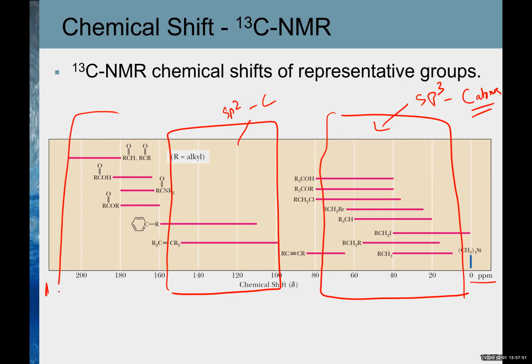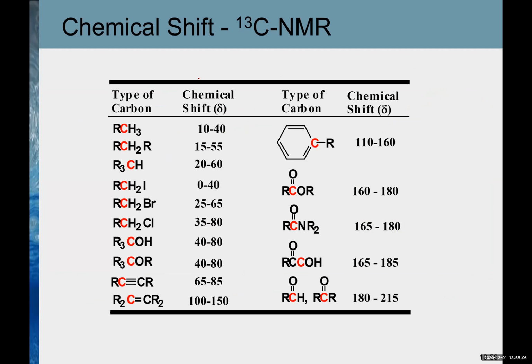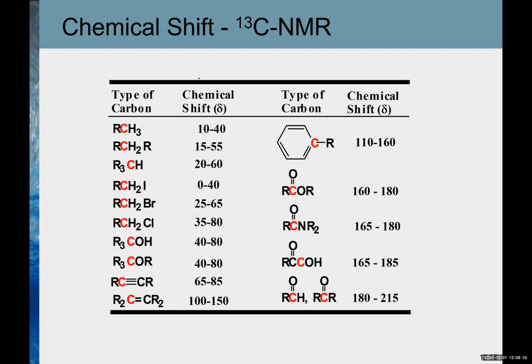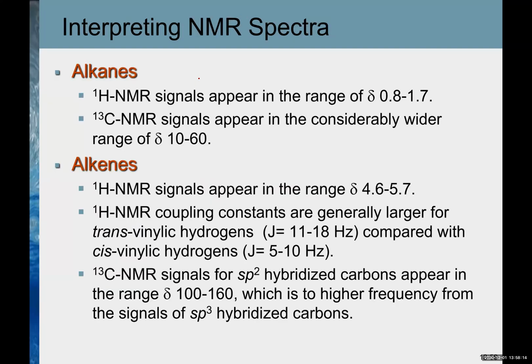And carbonyls are generally above 160, the carbons at the carbonyl position. So this is the data table for C13, which you can read.